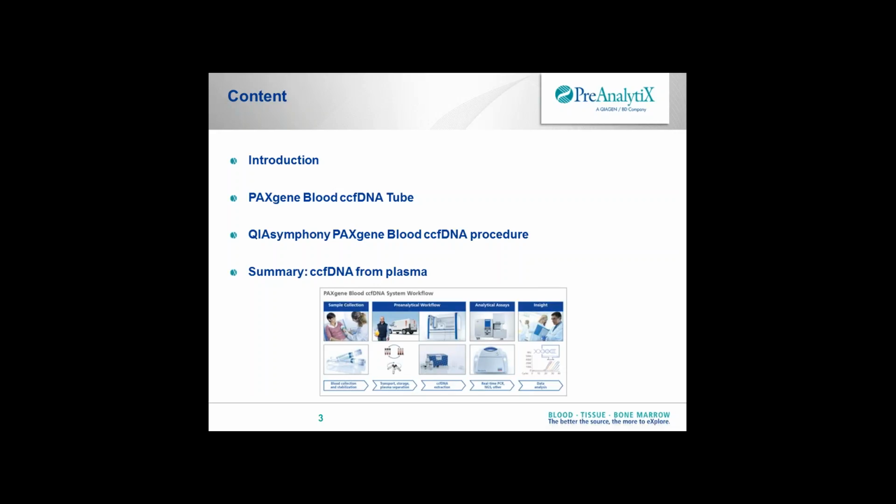And in the next few slides, I show you then the integration of this tube, and the plasma that comes from this tube, into an isolation procedure on the state-of-the-art QIAsymphony robot that we have here. And finally, I summarize all of this in a few slides.